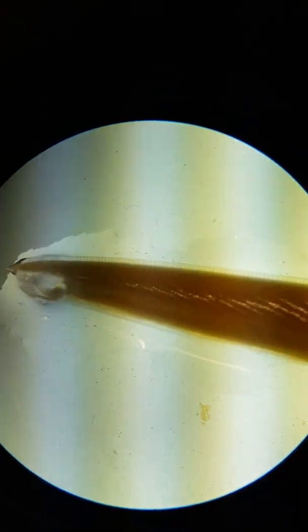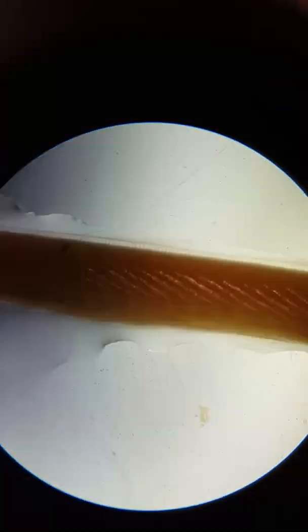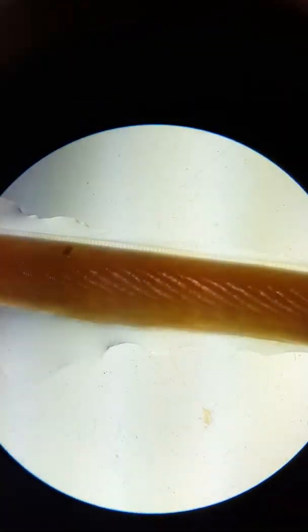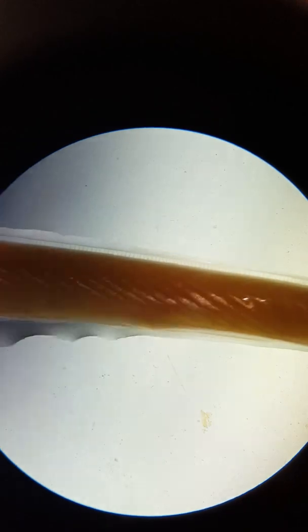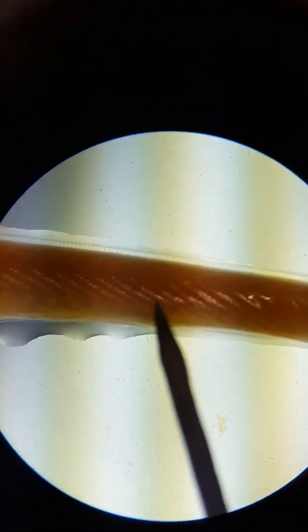So as we look down, the pharynx would be in there, and you can sort of see that atria inside, and the tail end. And there's probably the atriopore right there.